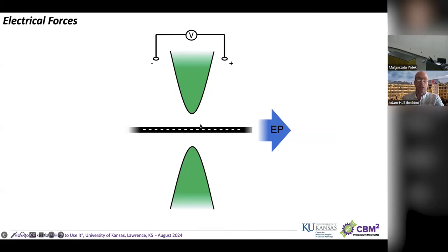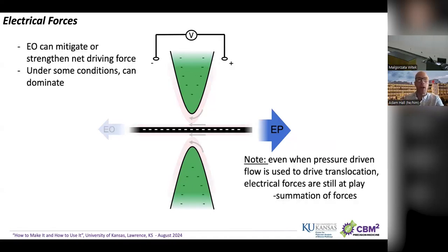So basically, this is negatively charged, so it's going to go towards the positive electrode, which is fine, except there's an awful lot more going on here. There are many things going on, but just to look one level up, there are also the charges in the salt that is in the buffer with this measurement being done. This is typically done at very high salt, and so those salt ions will interact with everything that's happening in the system.